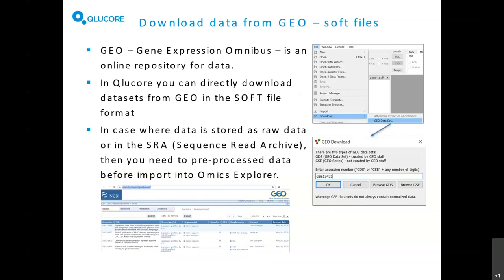First I'd like to remind you that you can actually download data from Gene Expression Omnibus directly if the files are in the format of soft files. You go under File > Download GEO Dataset, specify the name and press OK, and that type of data can be imported. However, in many cases today people are working with RNA sequence data stored instead in the Sequence Read Archive, SRA, where it needs to be pre-processed before importing into Omics Explorer.